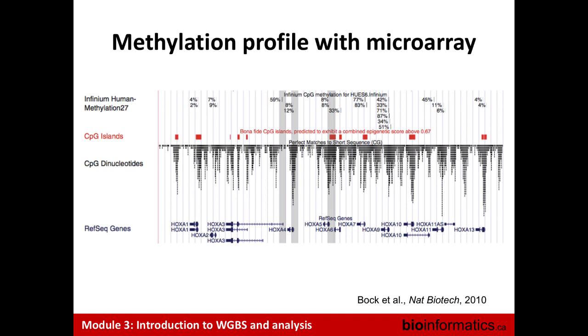I'm not 100% sure, but I think even calling CpG islands, you've got some parameters for what you call a CpG island. So this must be just in terms of density, some parameter around that, but I'm not exactly sure.